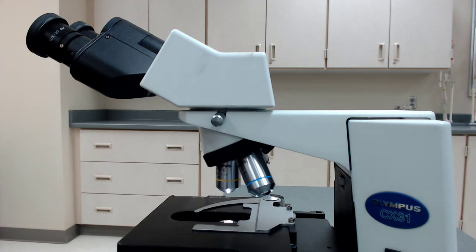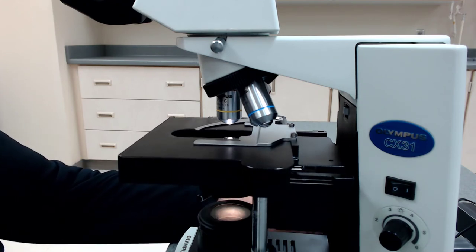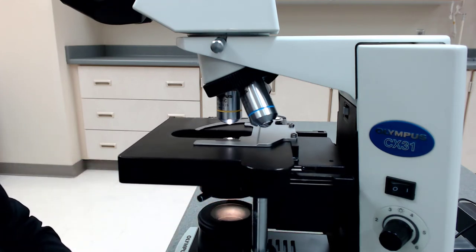Now, so it's called a binocular parfocal compound light microscope. So I think the light part is easy enough to understand. The energy source here is a beam of visible light. So it's just a normal little light bulb in there.